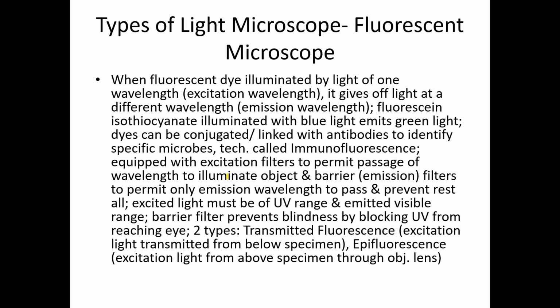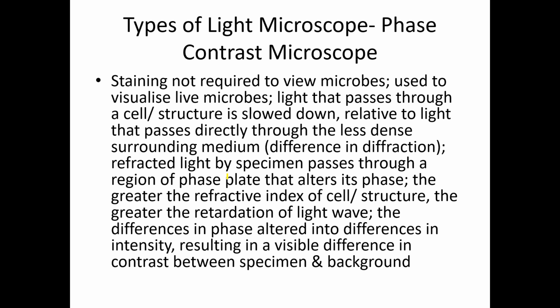Fine. So now, what is the specialty of today's topic, that is, the phase contrast microscope? Staining is not required to view with a phase contrast microscope. That is the first thing you have to understand about phase contrast. We don't need staining, which means it can be used to visualize live microorganisms. That is the most important point of the phase contrast microscope. We can visualize live microorganisms using phase contrast microscopy.